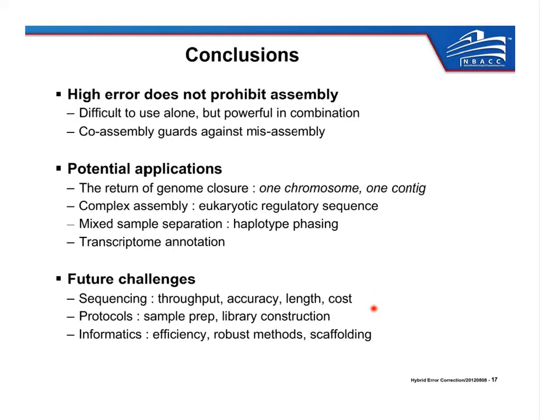And then there's some work remaining for us in terms of improving the efficiency of our tools, and also in best leveraging the high coverage Illumina data and the PacBio data together at the same time.